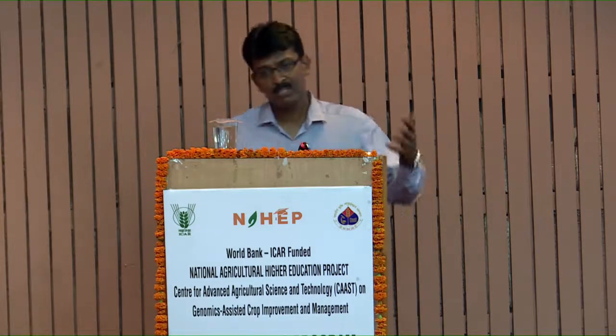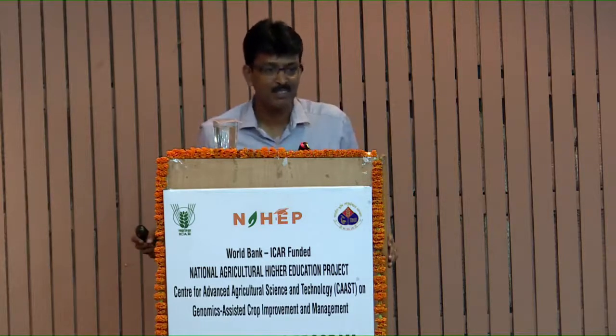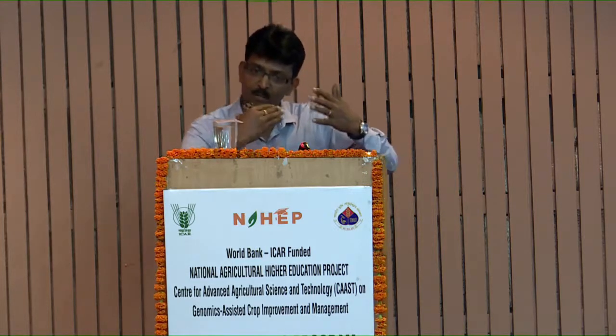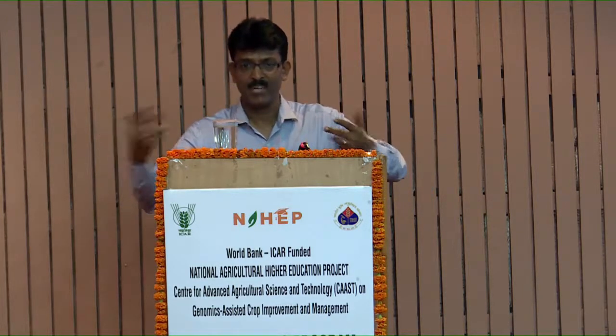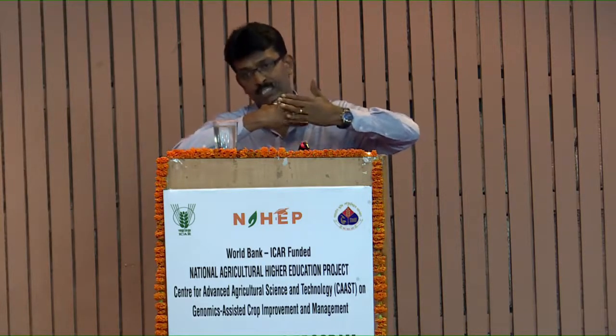What is the property of a single-stranded DNA? Whatever single-stranded molecules are there, they will go and complement with each other. So the probes, which are freely floating in the PCR mixture, have complementarity with the target, and this probe has two chemicals attached to it, one on the 5' side, another on the 3' side. They will go and bind to the single-stranded template now.